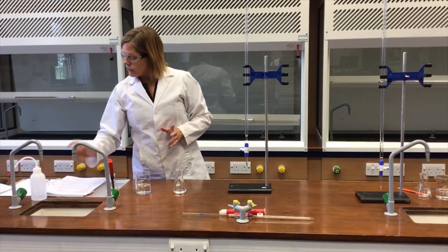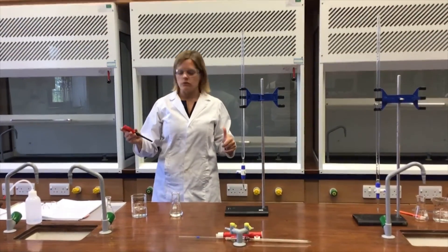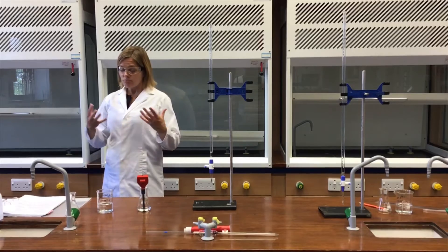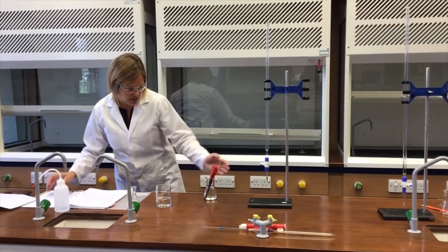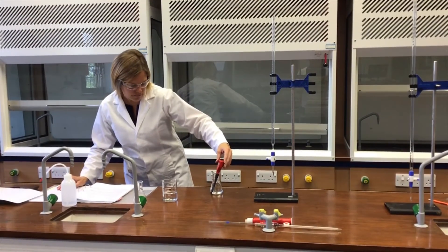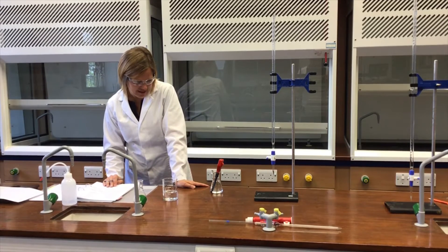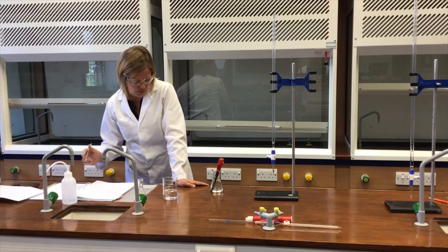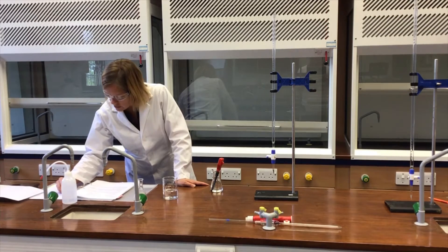According to my recordings, the first reading I need to make is with 0.00 cm³ of sodium hydroxide added — in other words, record the pH of the original solution. I'll sit that pH meter in there and let it settle. It's still dropping down. That seems to be settling now at 3.17. So the pH meter reading with no sodium hydroxide added is 3.17.